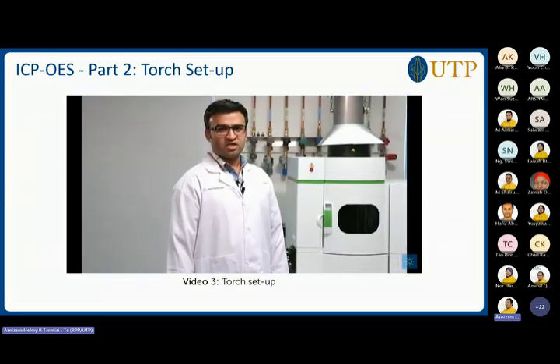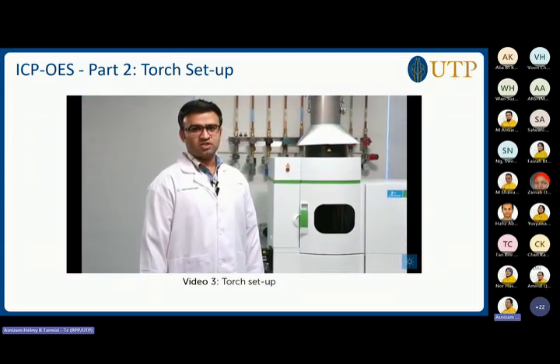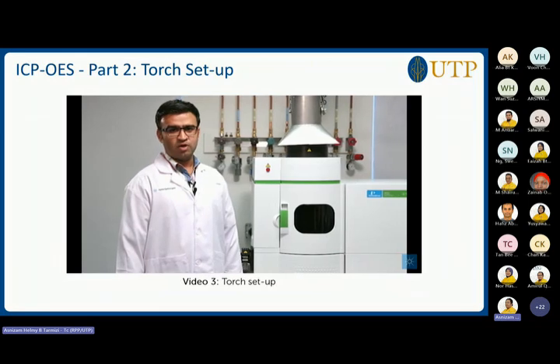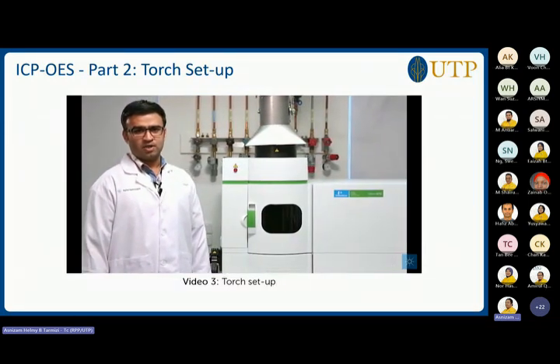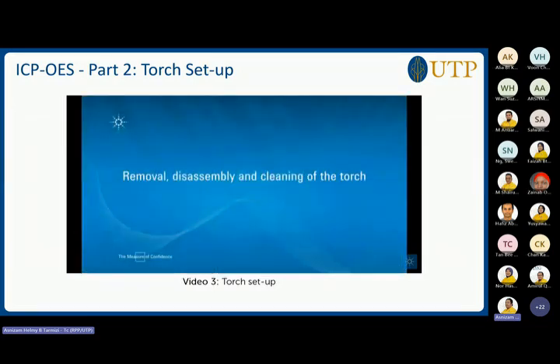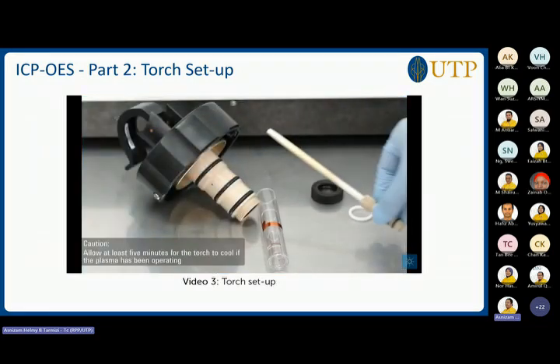This is the second of a series of instructional videos to help you achieve the best performance and productivity with Agilent supplies for your PerkinElmer Optima ICP OES. Now, let's look at torch maintenance.